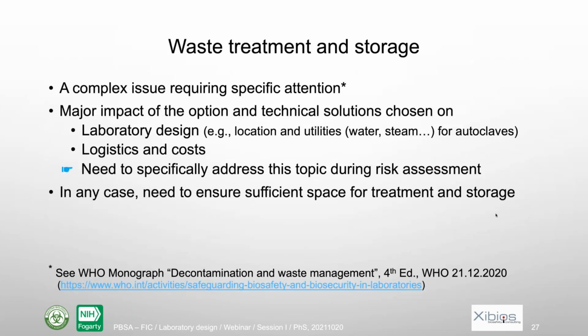I will not speak much about waste treatment because actually it's a very complex issue that requires specific attention. Still, you will need to think about what you want to put in place depending on the availability of some service, perhaps municipality services and so on, and some local regulations. One thing that is important to know with respect to laboratory design is that the technical option that we will choose for waste management will be very important with respect to laboratory design.